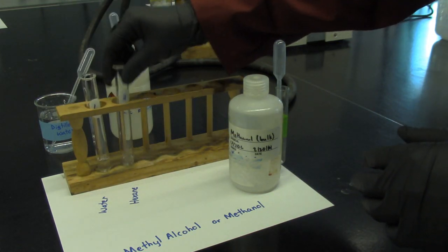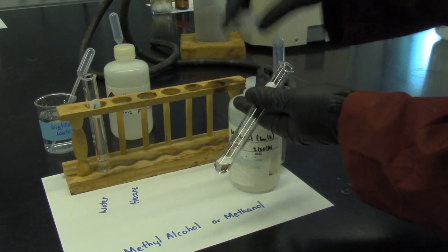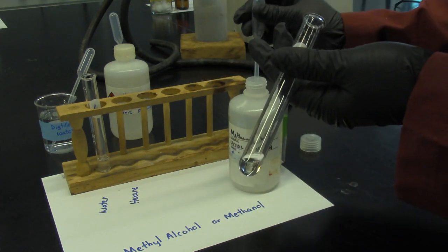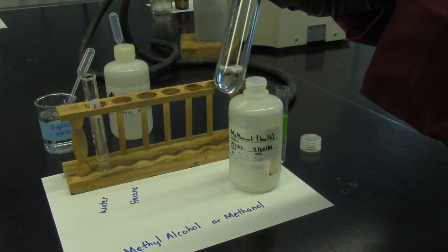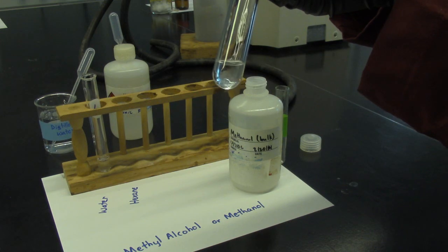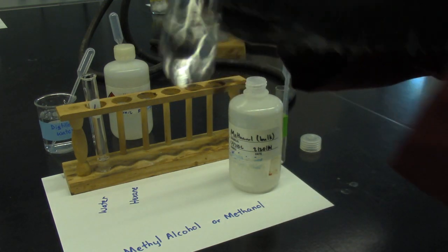Test tube number 2, we have hexane as a solvent. First, we add methanol, a few drops, 1, 2, 3, 4, 5, and shake it.